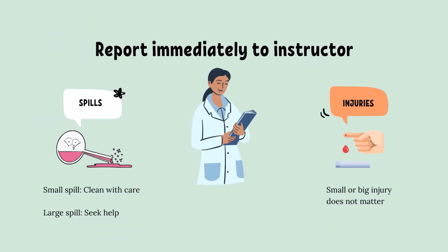If there are spills or injuries in the laboratory, report them immediately to the instructor. If it is a small spill, clean it with care. If it is a large spill, seek help. As for injuries, it does not matter whether it is a small or big injury. Just report them to the instructor without hesitation.